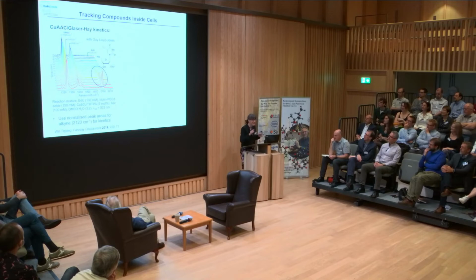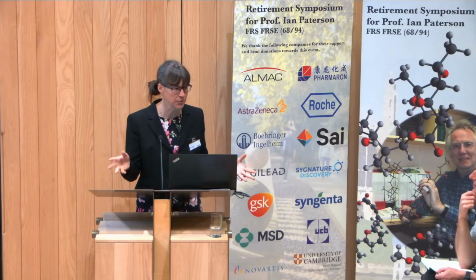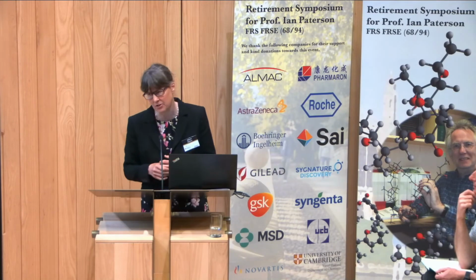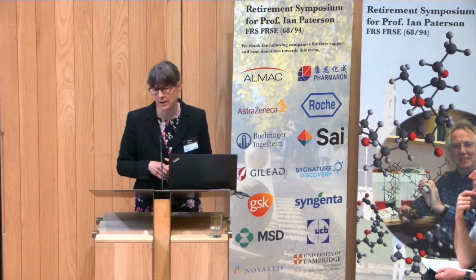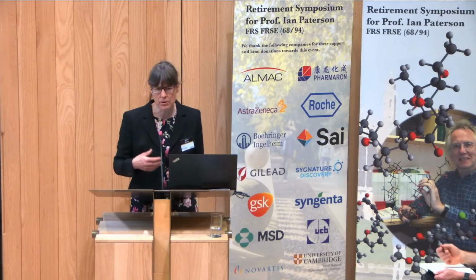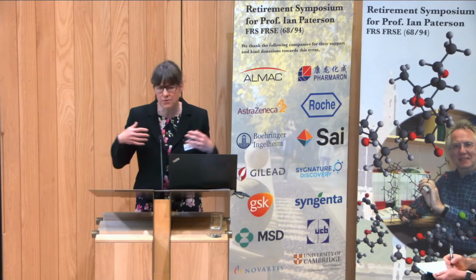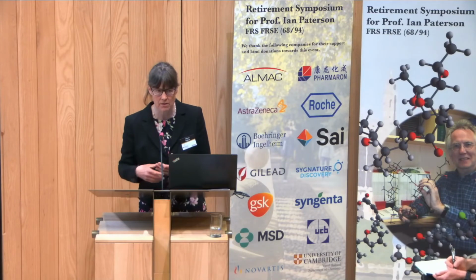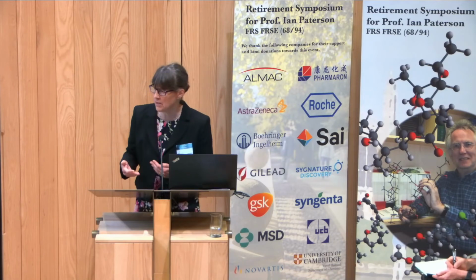I am going to keep going with tracking. So for me, tracking was taking that compound that I had, it going into the cells, viewing it directly. I can track also what might happen to it in terms of reactions. So I have 2 colleagues in Edinburgh, Mark Bradley and Asier Unciti-Broceta, who are both looking at ways of making molecules inside cells or in a tumor or cell environment by bringing them together with things like click chemistry.